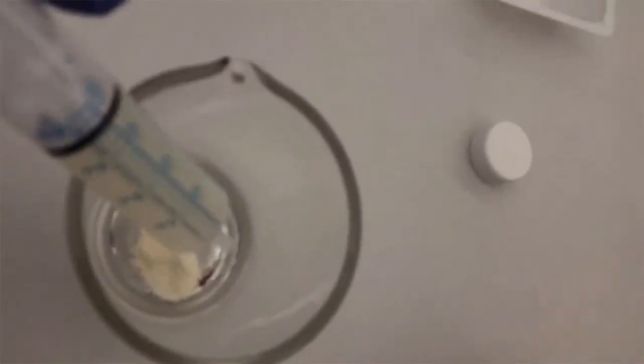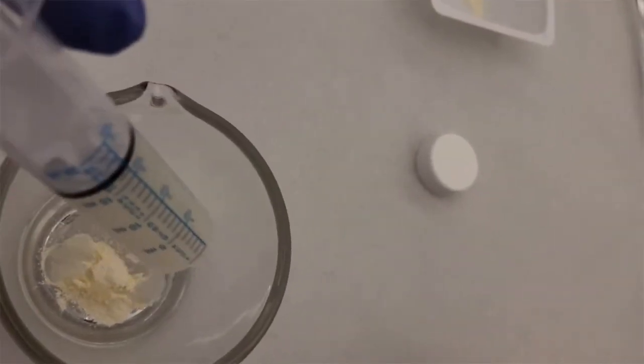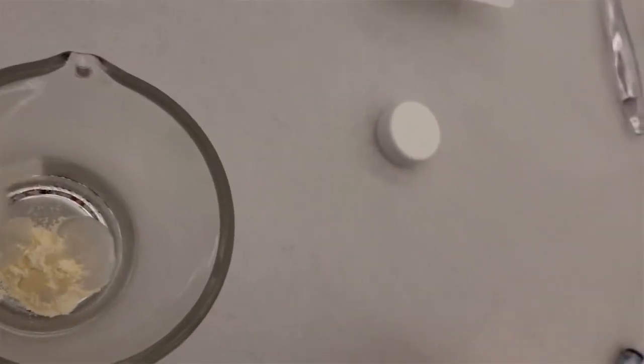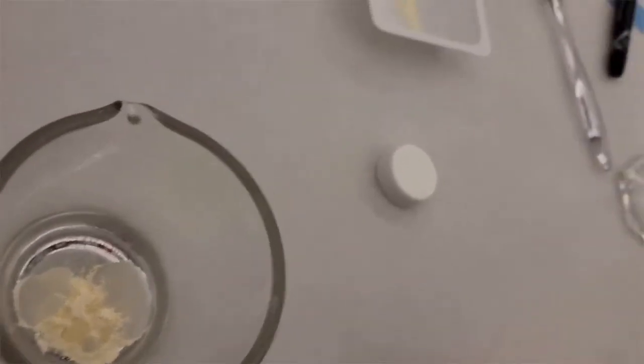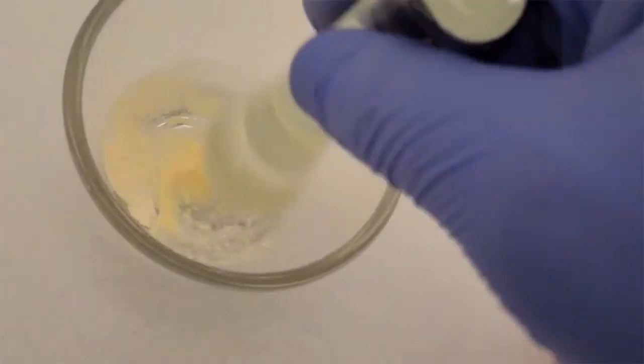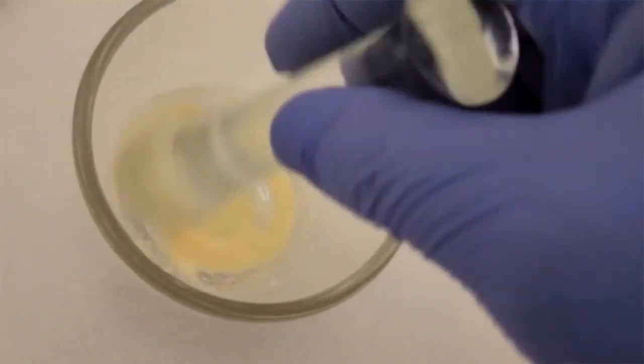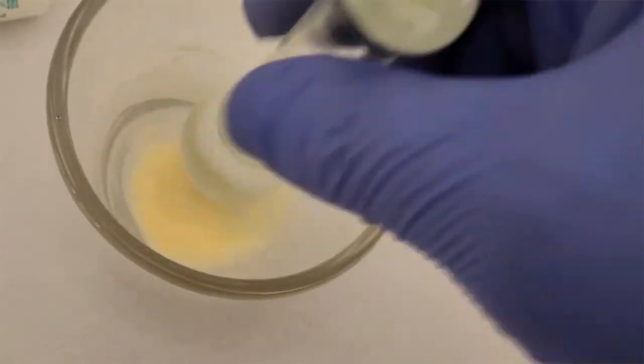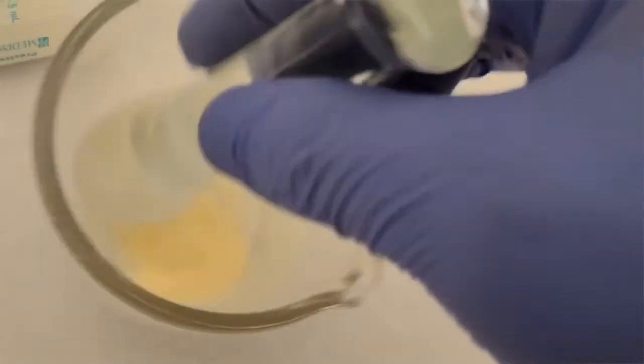So what we're doing here is we are adding a small amount of that suspending vehicle. You don't want to add all of it because the particles will start to float and you're not going to be able to levigate them. So I'm levigating them. Remember, I'm making them into a paste with a liquid that doesn't dissolve them. So notice that I'm making it into this paste. I'm trying to get rid of those big chunks.